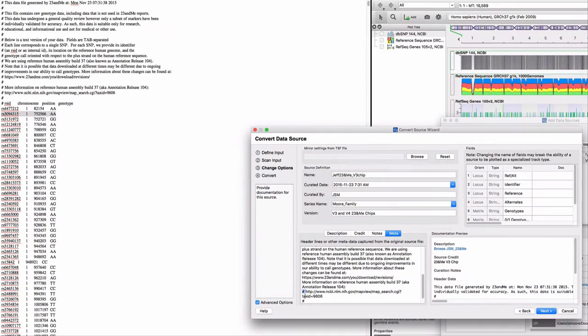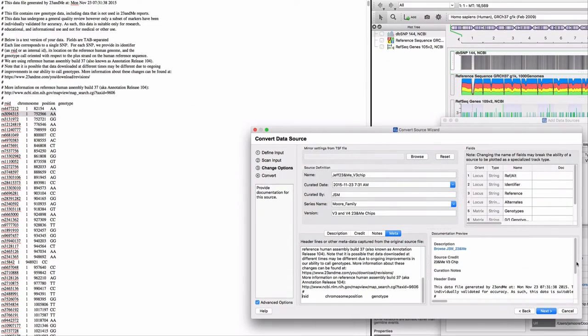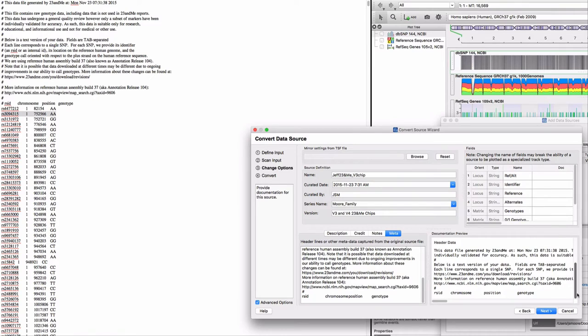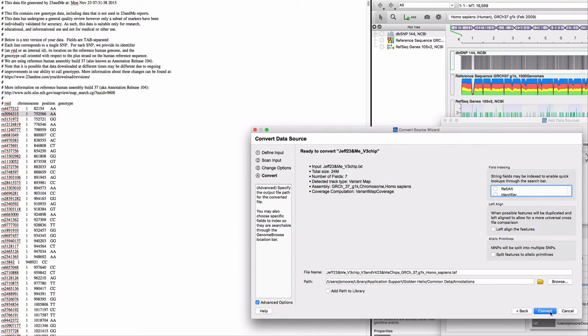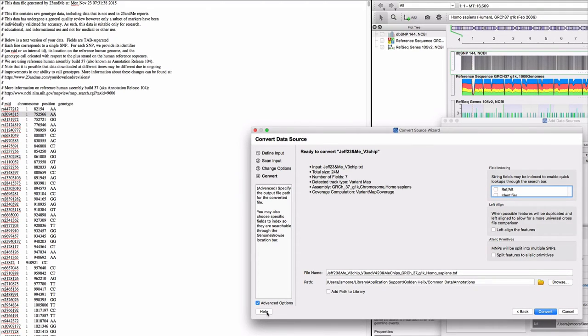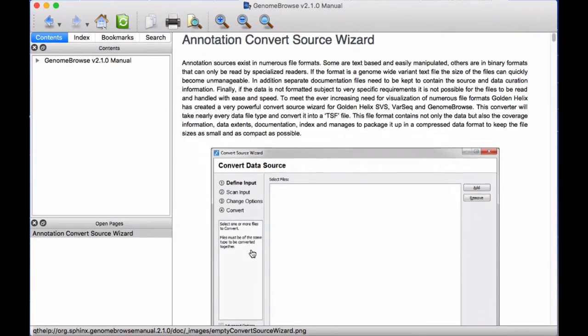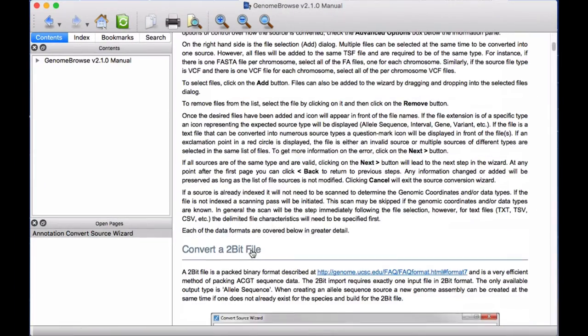Alright, let's finish importing the data. When you are finished editing the header data, click next. By the way, if you're ever unsure of what to do, help is just a click away.